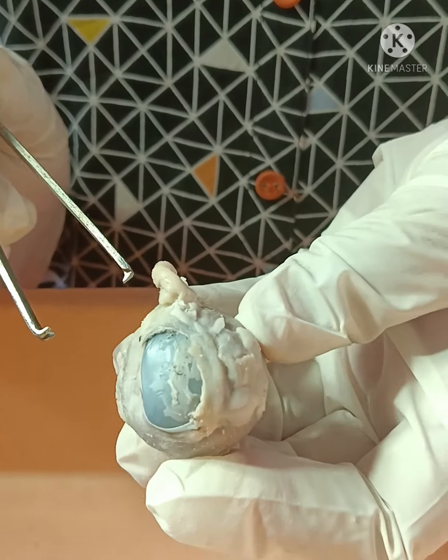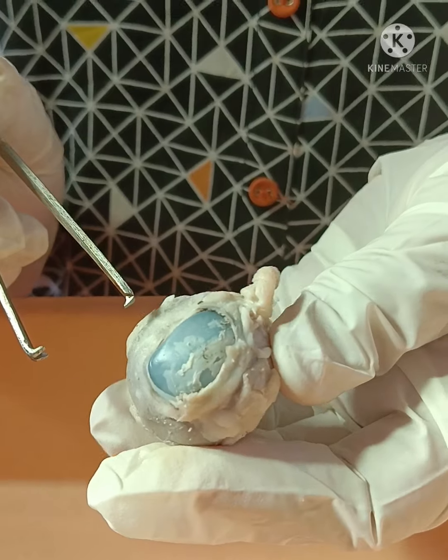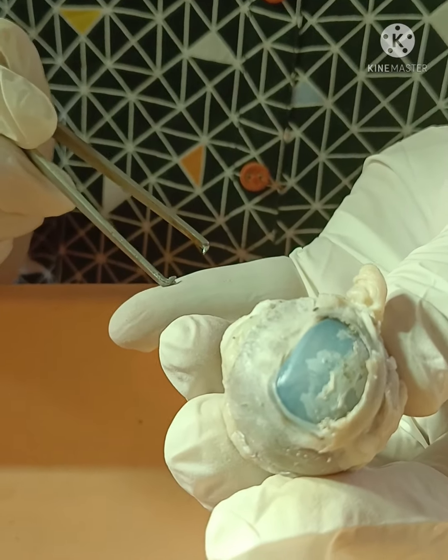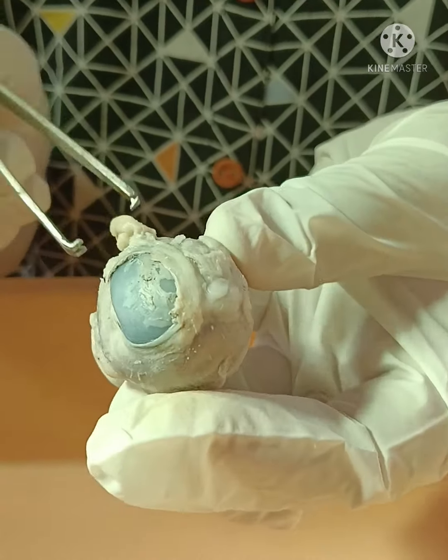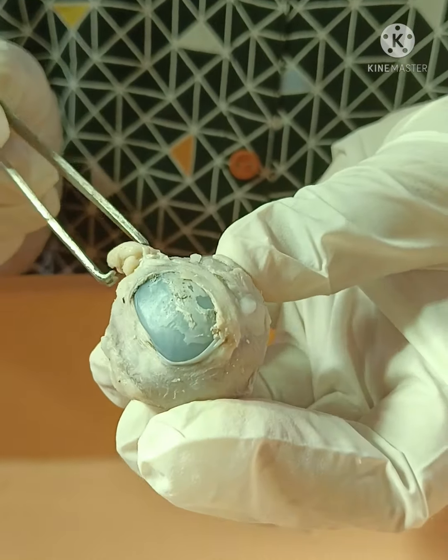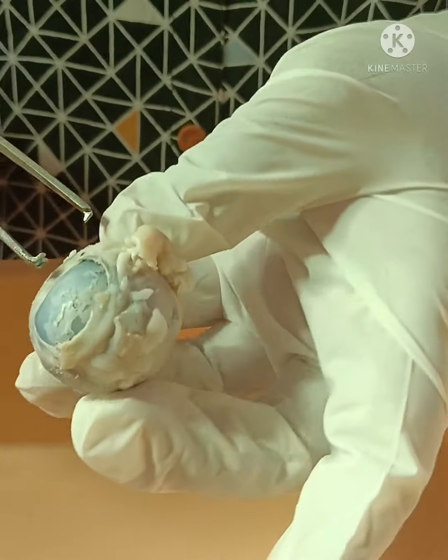In each eyeball, there are three concentric coats present: number one, the fibrous coat; number two, the vascular coat; number three, the nervous coat. So here we'll see all these coats, the layers, and the parts of the eyeball in this dissection. Here I am showing the eyeball.